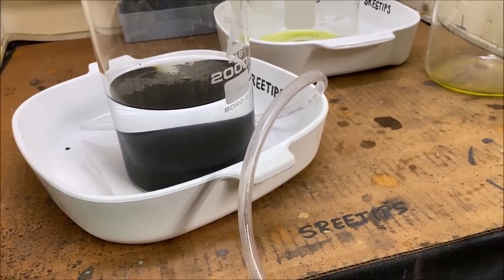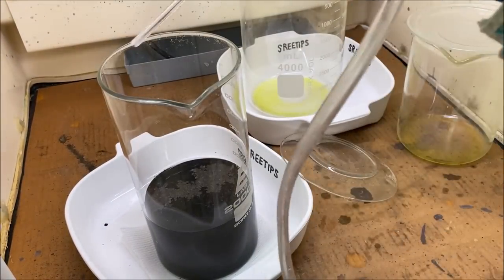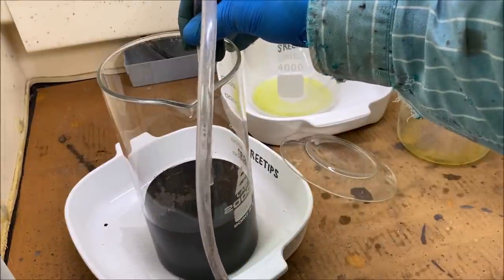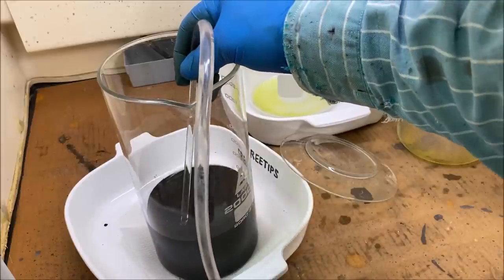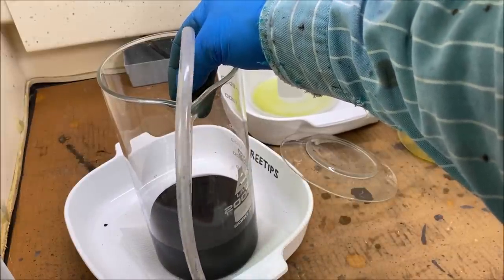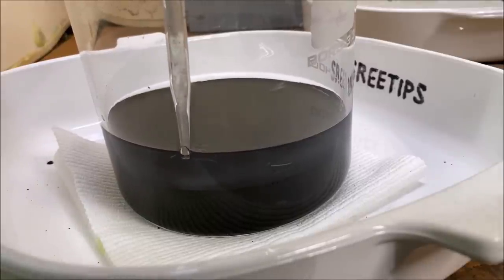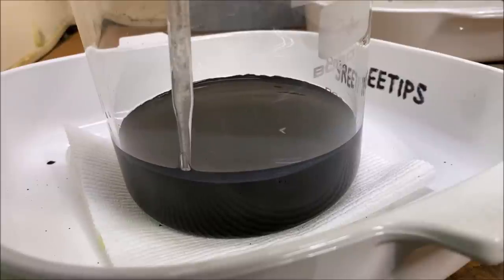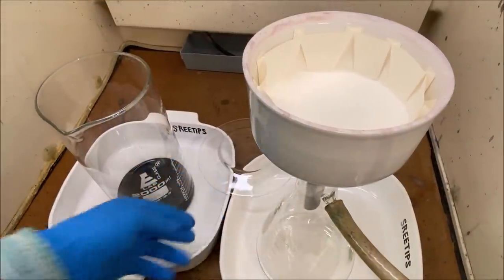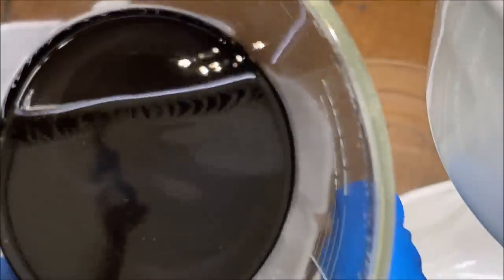Now we're going to draw off the water that's sitting on top of these solids. I've got a vacuum bottle set up here. Got a very fine tip set up on my vacuum bottle here. We're gonna get the rest of this liquid off of here without drawing up any of the solids. Here's a look at the solids down in the bottom of our beaker. This is looking pretty good, actually. It's nice, clean, black material from both of those stock pots.